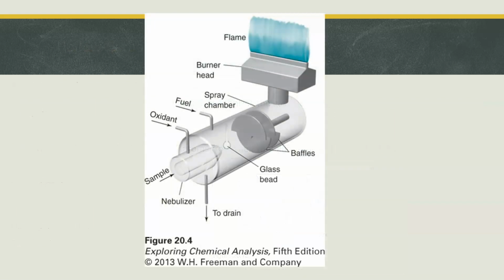Okay, so here's the fire thing. So here's where the hose will be. There'll be a hose right there. And your sample, I'm going to pretend like it's in a beaker. Okay. The sample will get pulled into the hose, and then it goes into this thing. So what happens here is it's a nebulizer. So it spritzes it. It makes it into a spray.